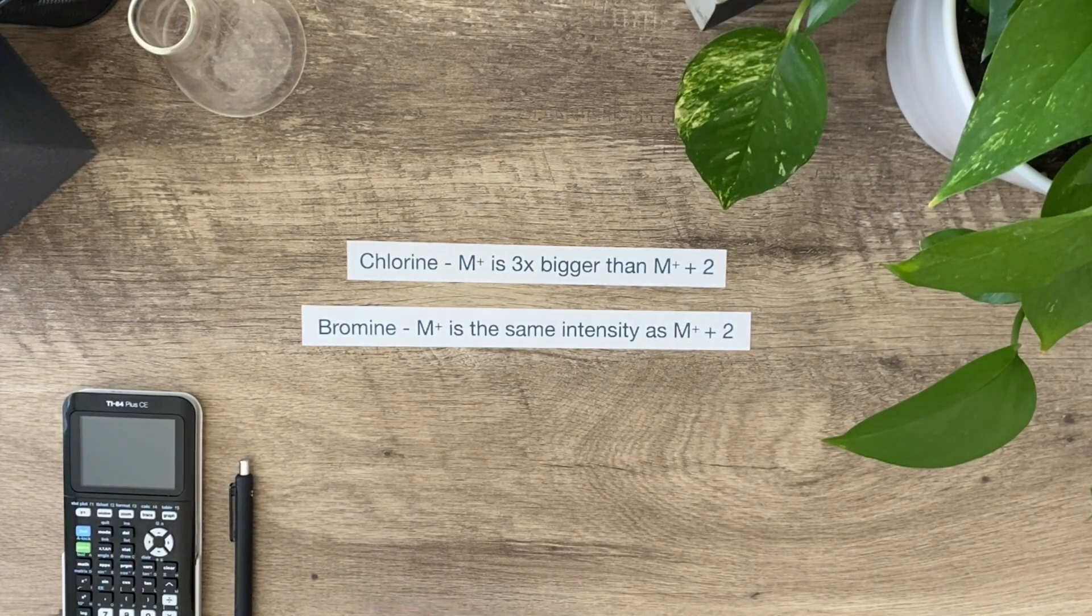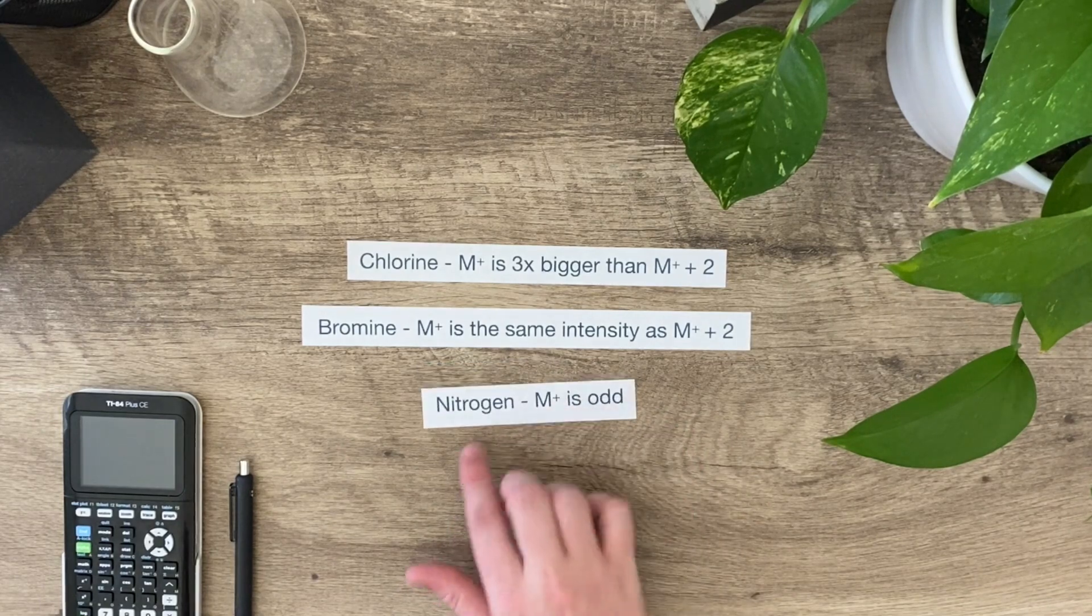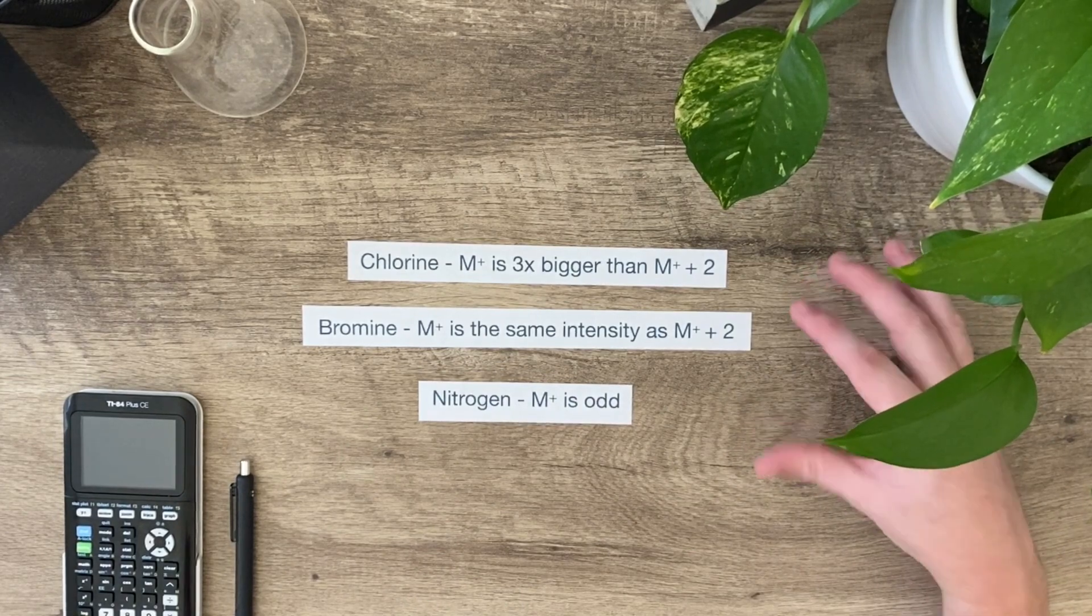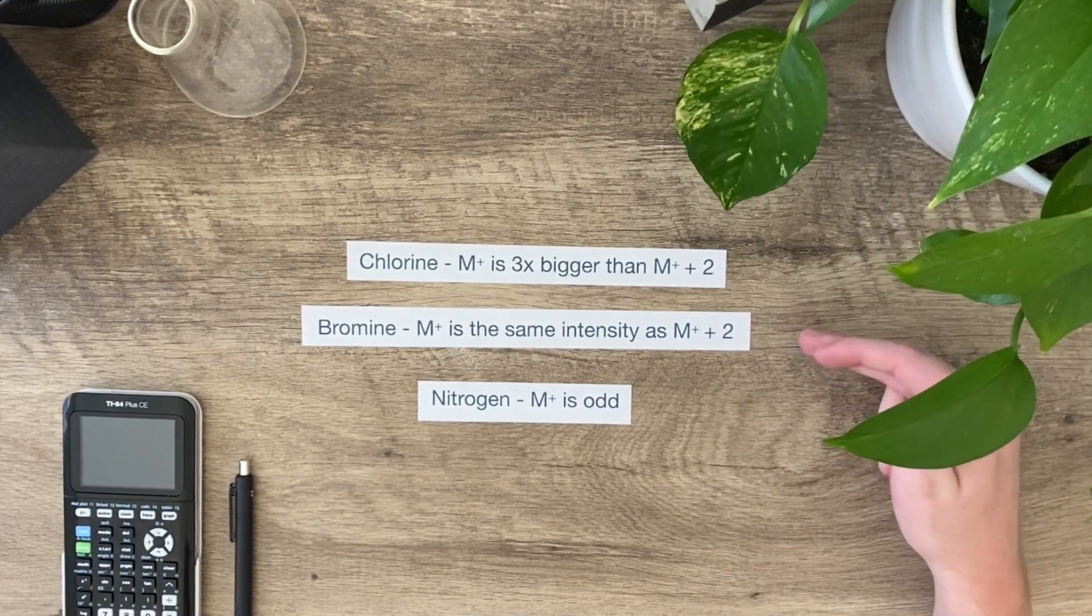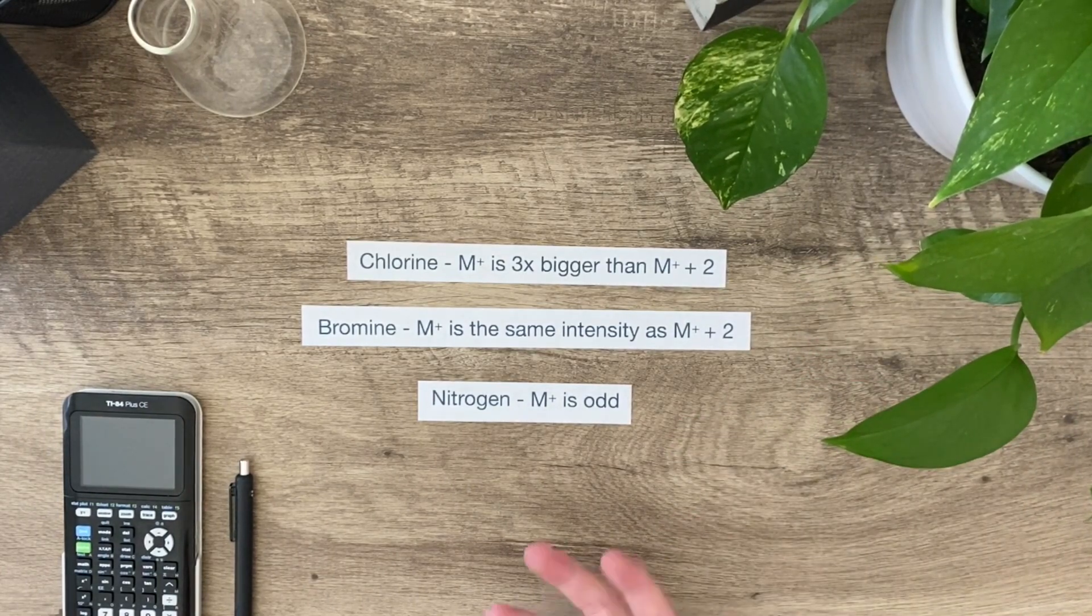The last one that I want you to be aware of is if the M+ peak is odd, that means that nitrogen is present. Those are the three things that you need to be aware of when you're given a spectrum. I might ask you, here's a spectrum, tell me if there's a chlorine present. I might give you a spectrum and ask if a bromine is present or if a nitrogen is present. You can also be able to identify the atom based on the actual ion peaks present.